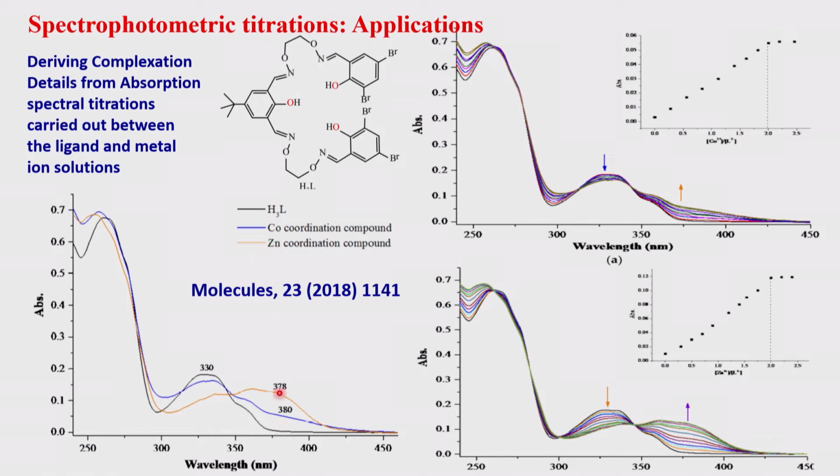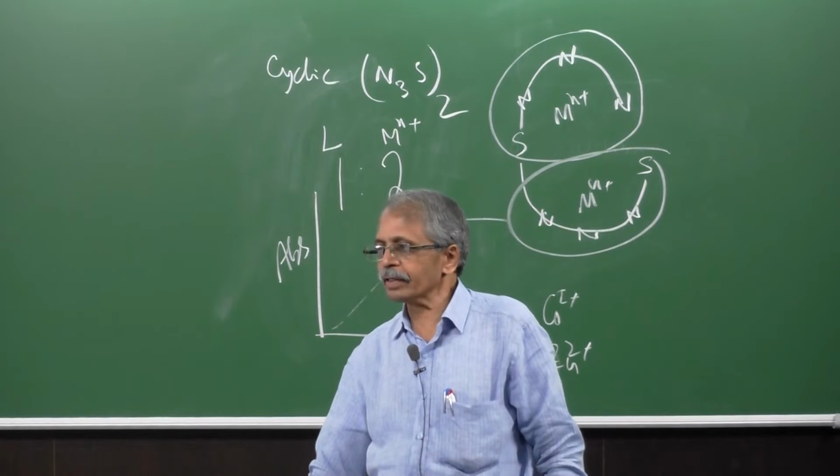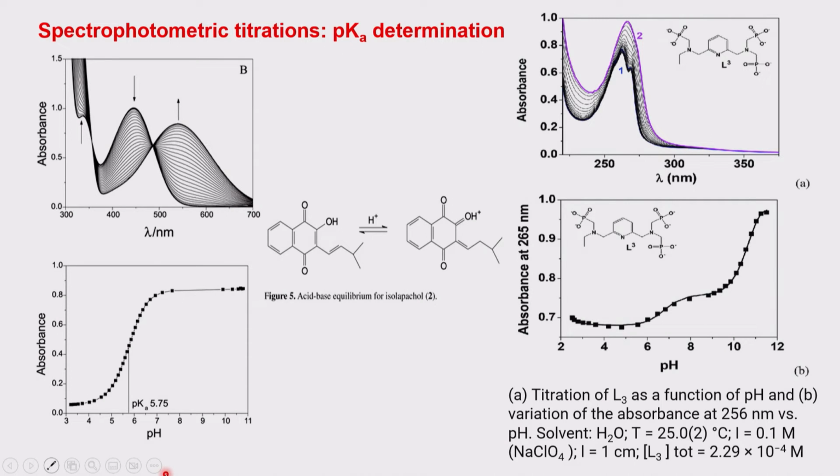the cobalt is with the blue thing, and the complex of the zinc is shown over here. It's the final complex. This is a titration, this is the absorption spectra of the final complex. That means you complete the whole titration, isolate the compound, redissolve, and look at the absorption spectrum. So this last spectrum here would match with the last spectrum over there, because the complex is completely formed. So I hope these several demonstrations will make your understanding stronger.